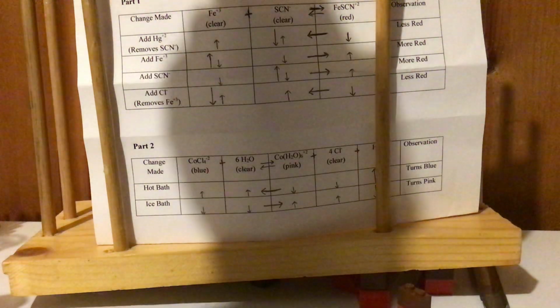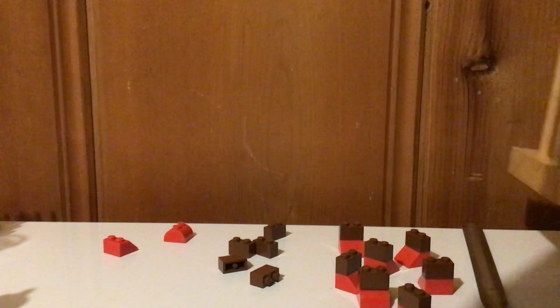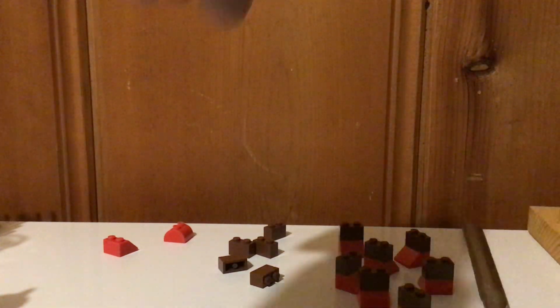Now, what's going to happen is, let's show this, and we are going to take away some of this right here. Okay, and what's the system going to do? Oh, we need to replace some of that SCN minus that we lost.